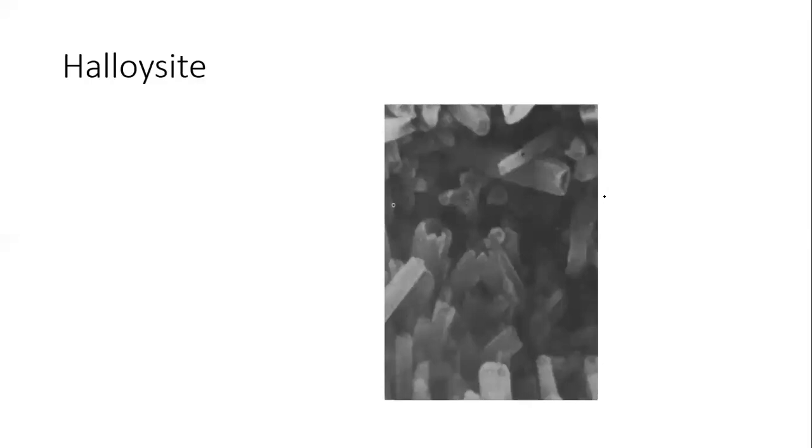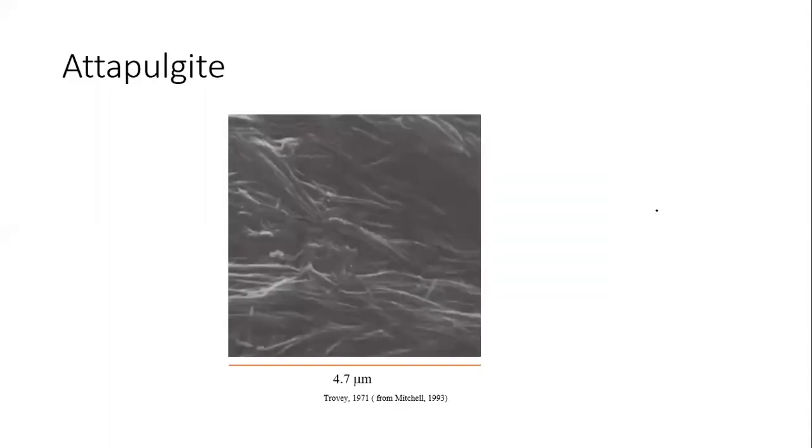This is the halloysite. We can see the halloysite completely, and what shape is present. We can easily see the 3D images. And there is another one, which is like this. So these are a few images.